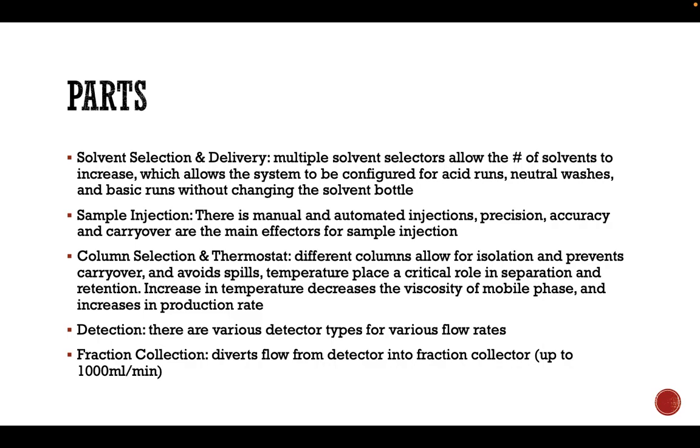We have the sample injection. Depending on the machine you have, there are manual and automated injections. The main effectors for a sample injection are precision, accuracy, and carryover.